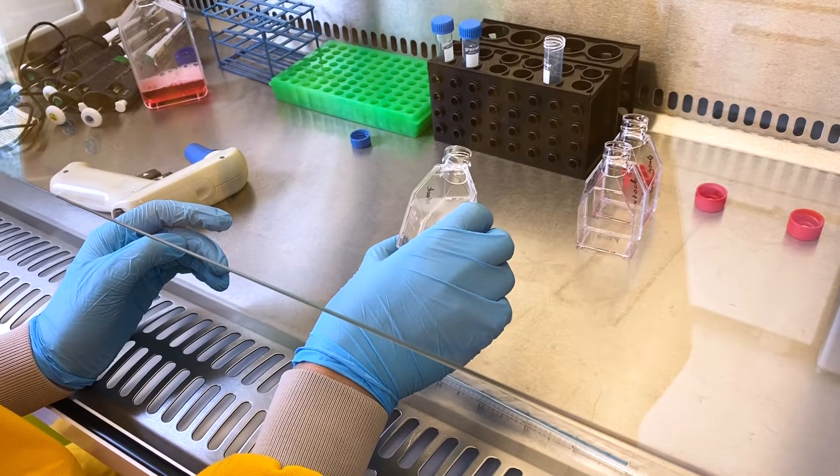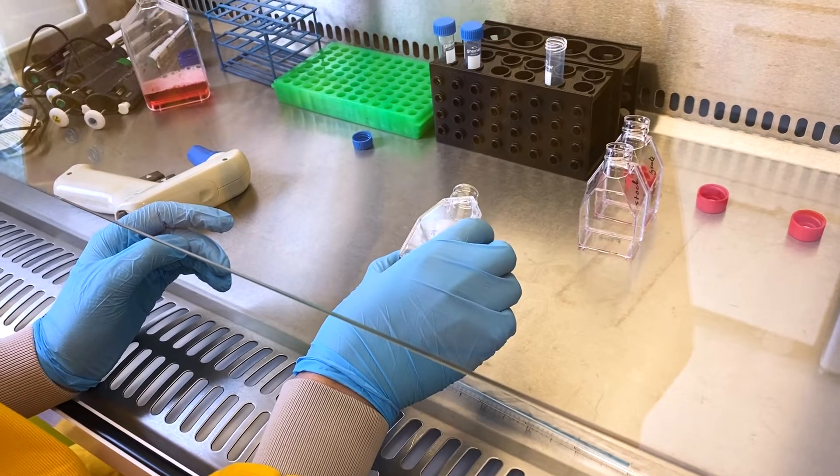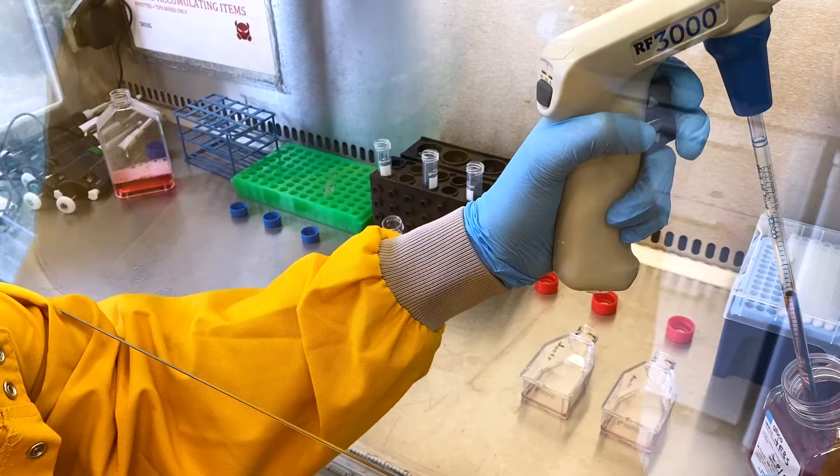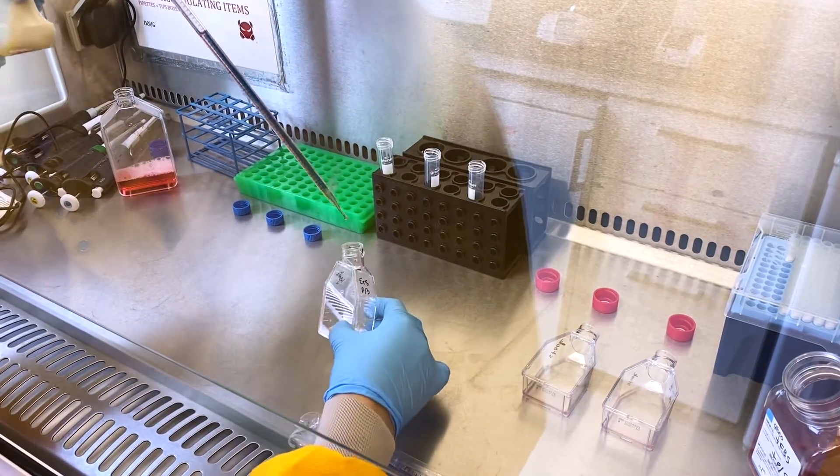My work in the lab started with growing human embryonic kidney cells, also known as HEK cells, in culture. After sufficient growth, the cells could be lysed, ready for the experiments.